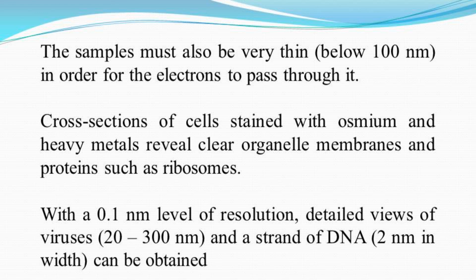With a 0.1 nm level of resolution, detailed views of viruses about 20 to 300 nanometers and a strand of DNA of about 2 nanometer width can be obtained.